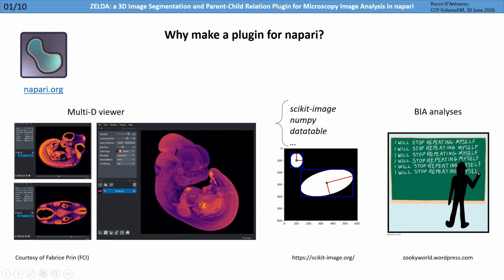Also, Napari is based on the use of libraries that are available in the Python environment. Very famous ones: scikit-image, in order to do image segmentation, NumPy to handle numeric arrays, and pandas for data tables in order to handle data frames.